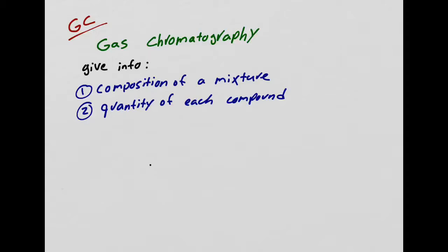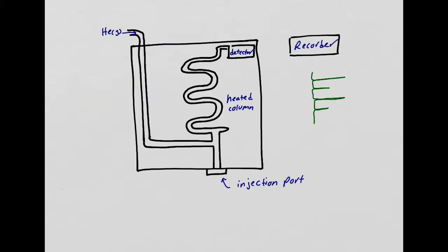Now let's talk about what a GC actually looks like. This is a GC, gas chromatography. It took me a while to draw this. It looks simple, but it is not simple. It looks kind of beautiful though now, huh? So here's my GC. I want to go over what happens and then how you inject your sample.